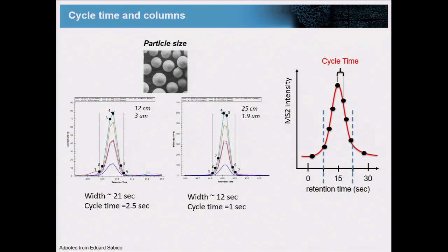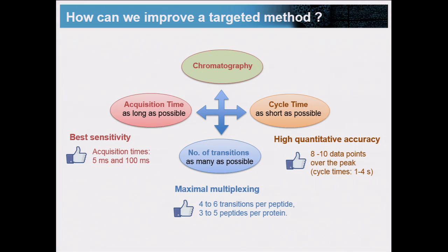So whenever you think of cycle time, you also need to think about your LC setup. So we have this interplay between chromatography, acquisition time, cycle time, and the number of transitions, and we always want to improve. Yeah, sorry.